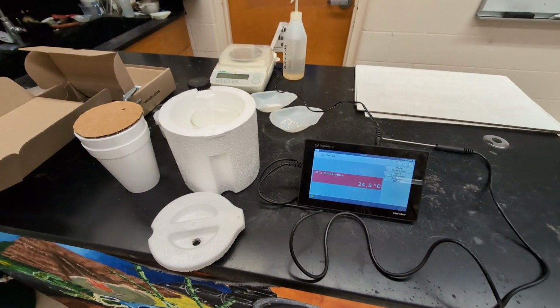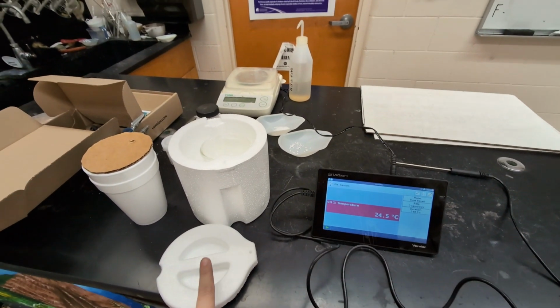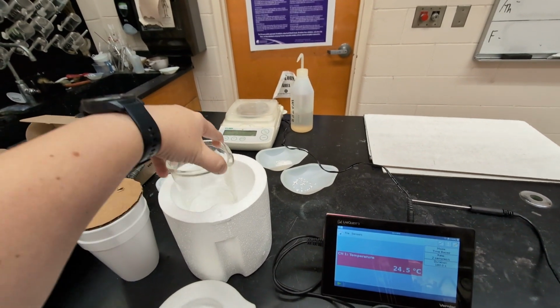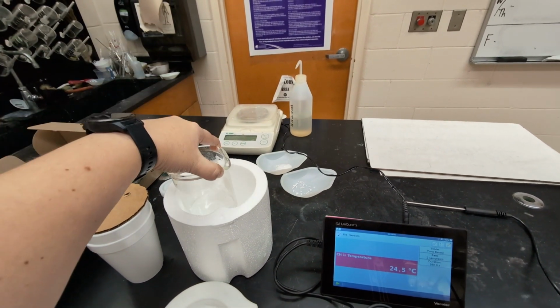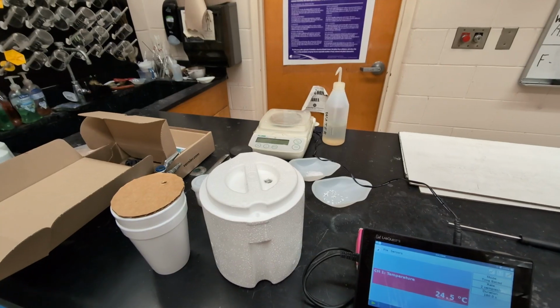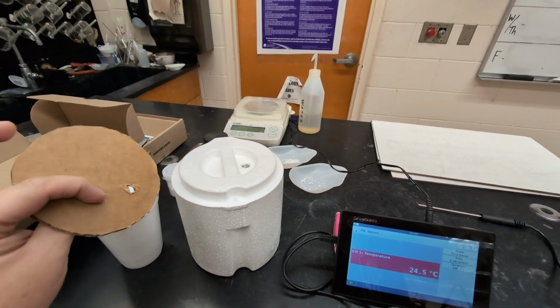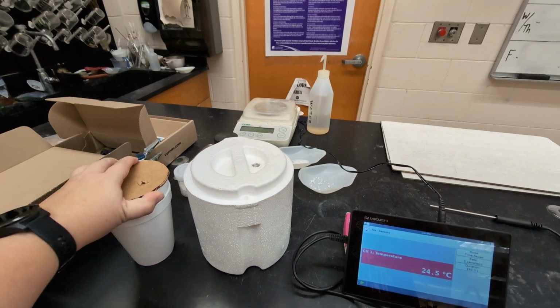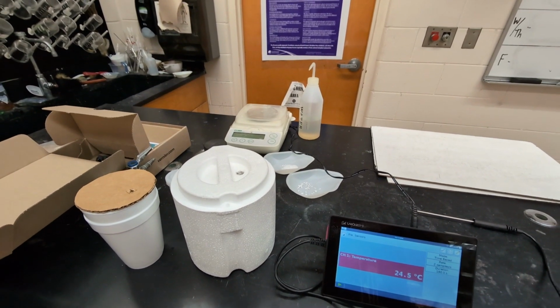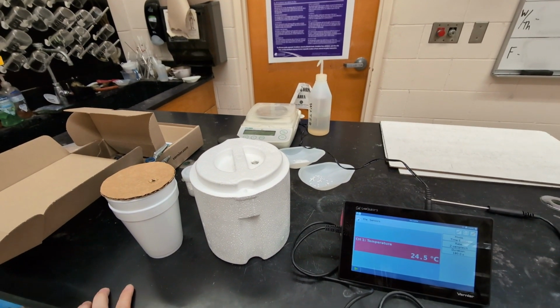I also wanted to show you two different types of equipment here. I have an actual styrofoam calorimeter that I've put a beaker in, with 100 milliliters of deionized water, nestled inside, and it has the lid. You could also just use styrofoam cups though, and I went ahead and cut out little tops for it, but you don't even need that, and you still get an okay result. And at least if you're doing a comparative study, it gives decent enough results.